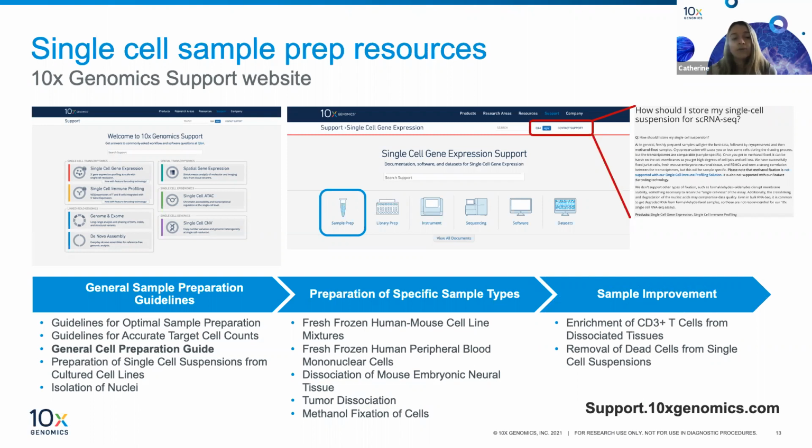We're always generating new documentation and new demonstrated protocols, and they will be added as we develop them. This is the work that we're doing in-house, trying different samples and getting protocols that work well in-house. The idea of these protocols isn't to take them and use them as is. They're there to use as guidelines to optimize your own sample preparation.